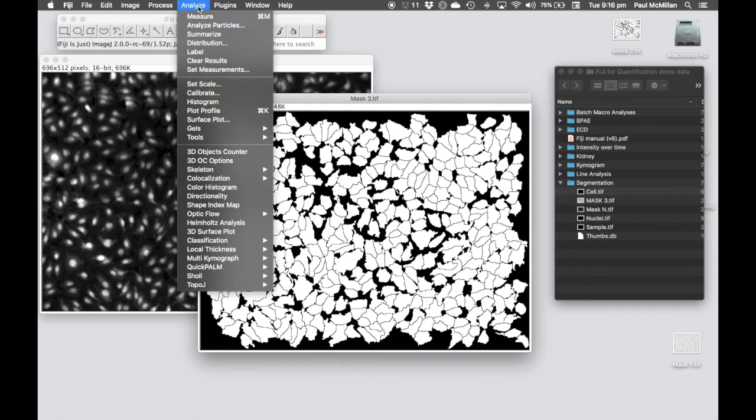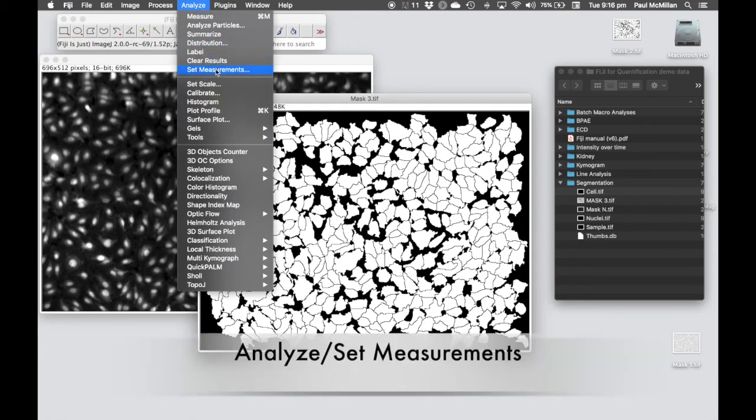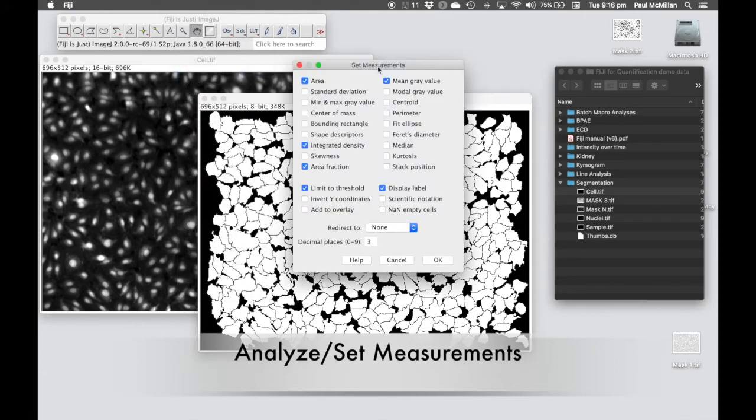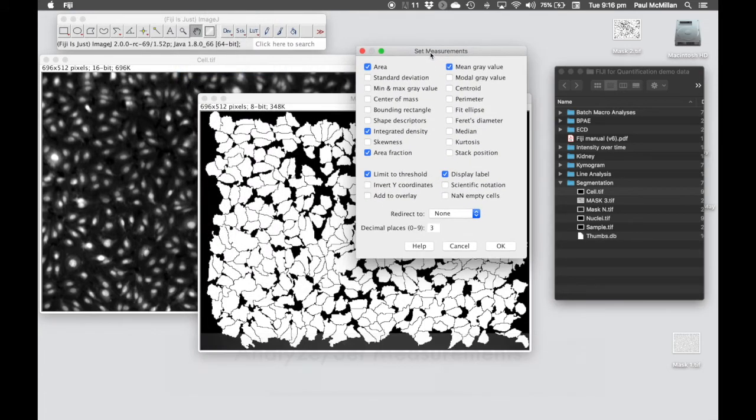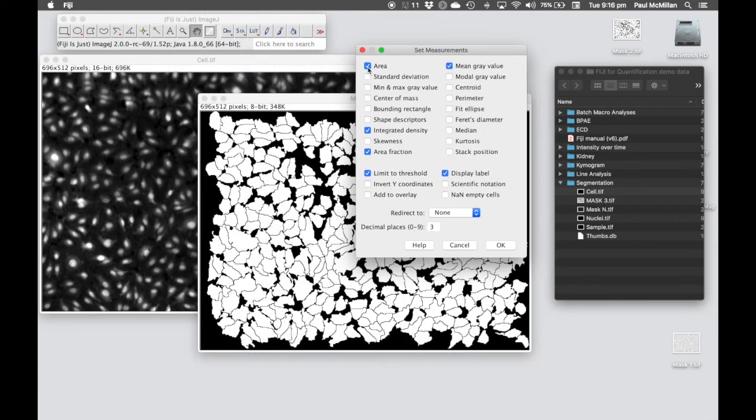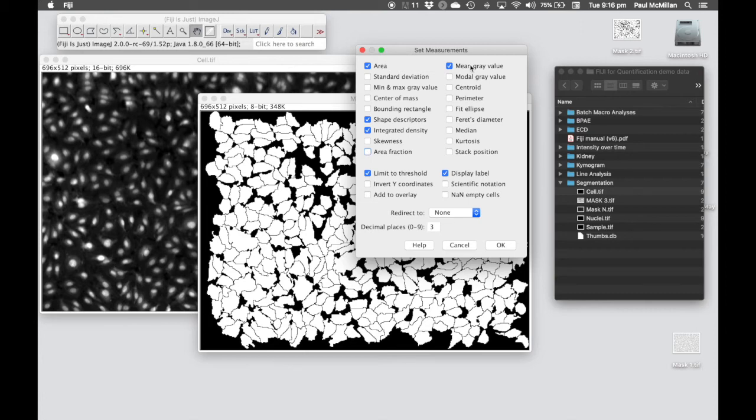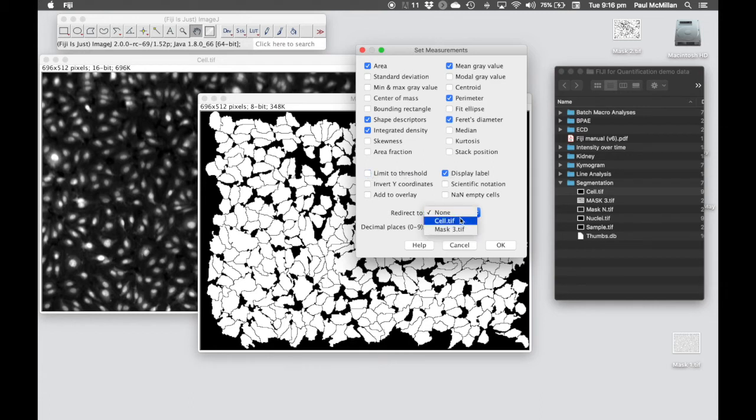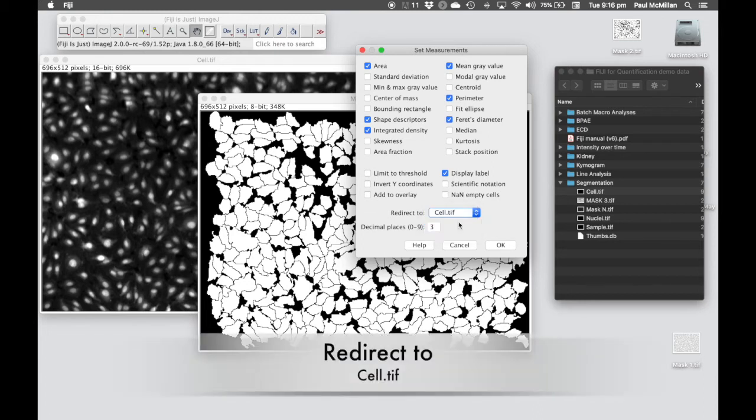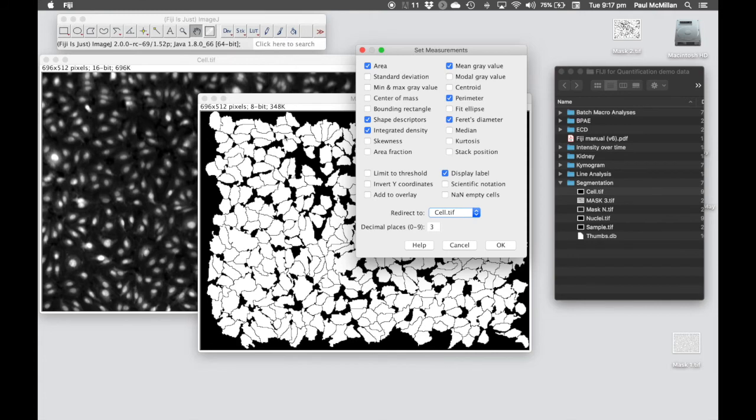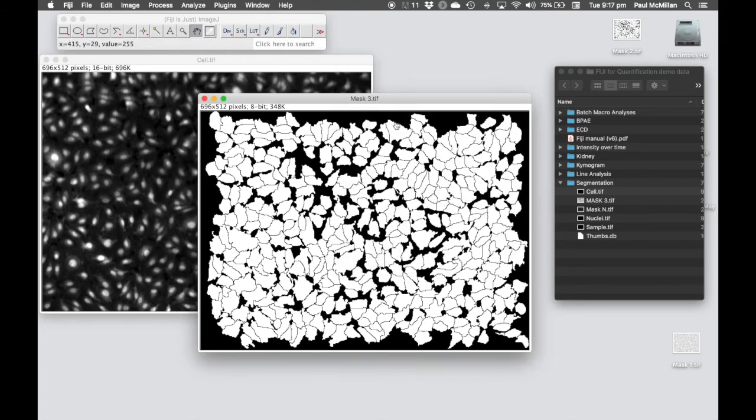How do we use the mask to actually analyze on a real image? We're going to go to Analyze, Set Measurements, and set the readouts that we want. In this case we're going to Area, Shape Descriptors, Integrated Density, Mean Gray Value, Perimeter, Ferrets Diameter, and Display Label. We don't want Limit Threshold, but we want to redirect it back to the cell.tif image. We're saying use this binary mask, but redirect the measurements back to cell.tif. Hit OK.